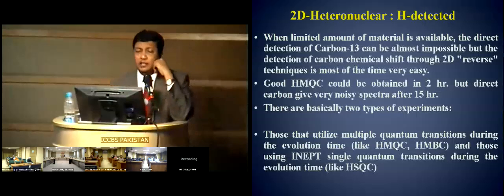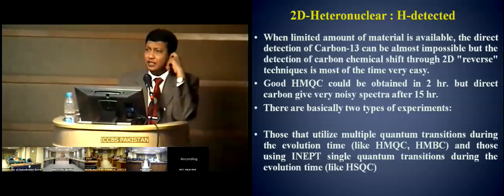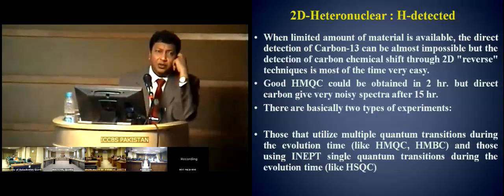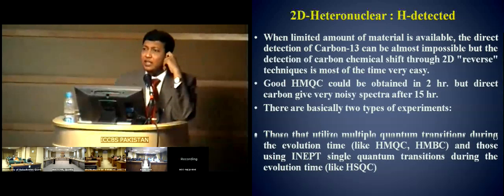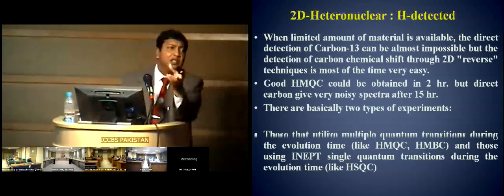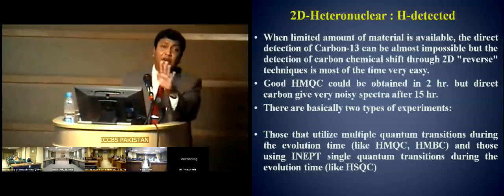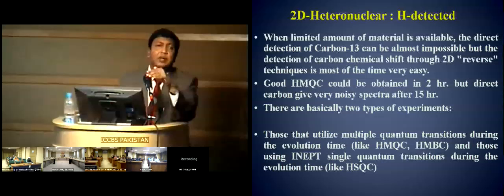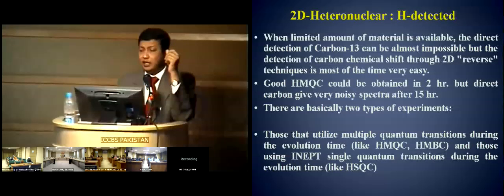In case of an inverse probe, you have exactly the reverse. You have a proton coil, the detection coil, close to the NMR tube, and the carbon, which is your source nuclei, a little away from it. So there is a slight architectural difference. This doesn't really mean that you cannot record an inverse NMR spectrum on a normal probe. You can do that, but sensitivity would not be that great.